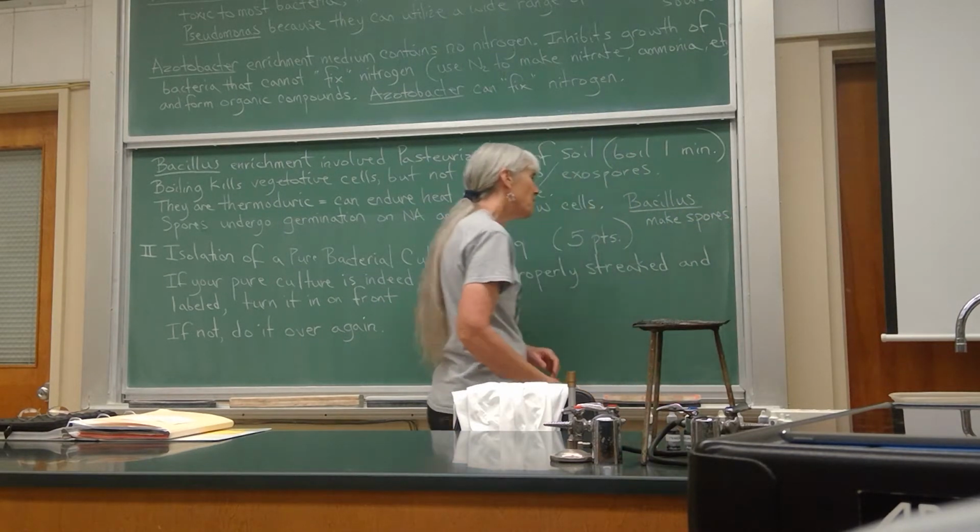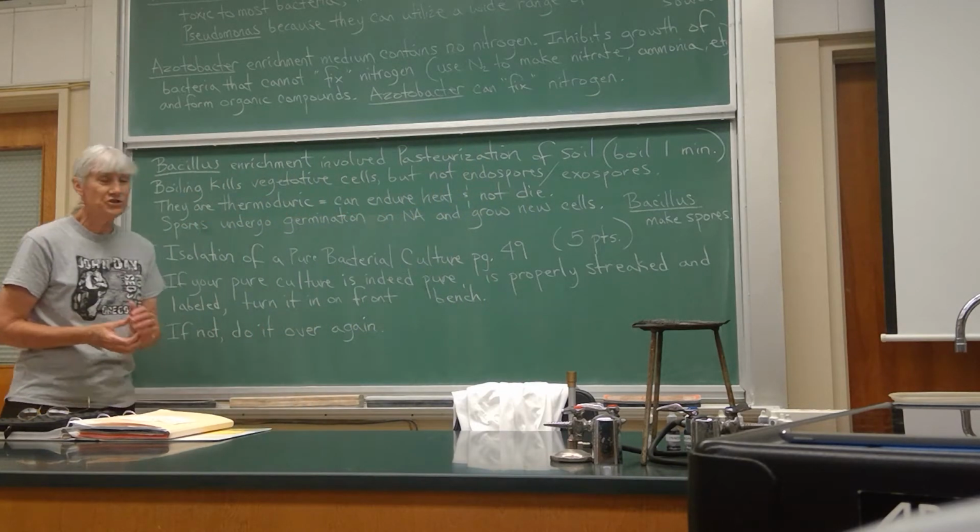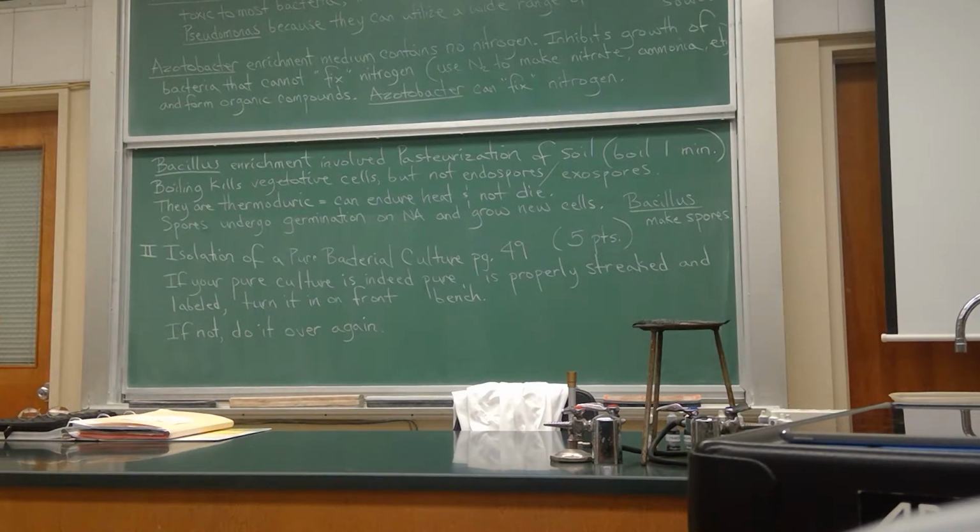So the bacillus are endospore forming bacteria. They're one of the genera. So this is our soil enrichment. Again, this is an assignment that is going to be due in a couple of weeks. But I wanted you to get the gist of what is required for this, because we just keep having new assignments. They just keep piling on. So get this stuff recorded.